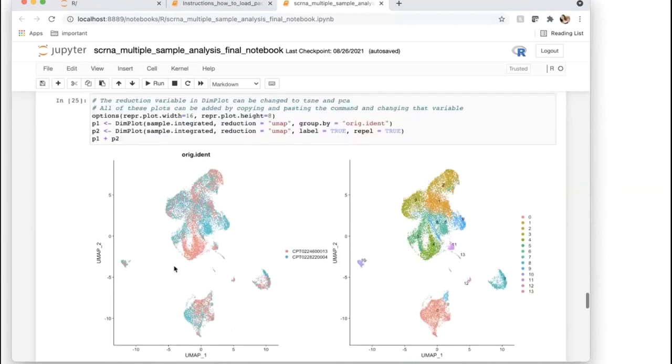So first we can overlay sample 1 and sample 2 clustering together. So you can see they are slightly different as far as their clustering. And then we can also see how each cluster clusters together here. So this is all of the data combined, and this is sample 1 and sample 2 overlaid with one another. And you can kind of look and compare one to the other.